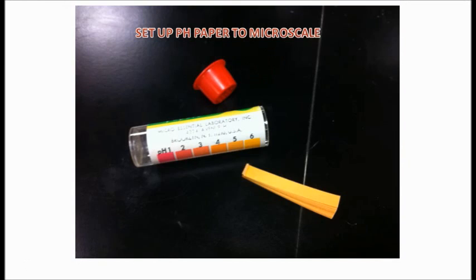So cut the pH paper. If you notice, the pH paper vial has the key so that you can read it. Based upon color changes will determine what pH level it is. I believe 14 is greenish, while pH 1 is magenta. Anyway, you are going to take that long strip.